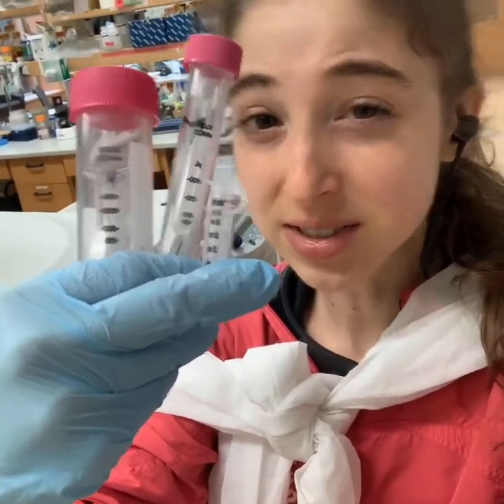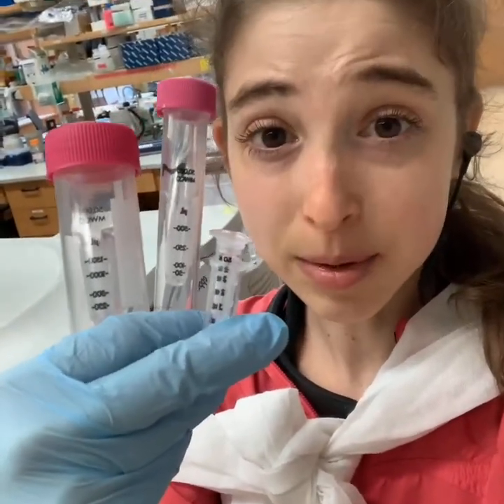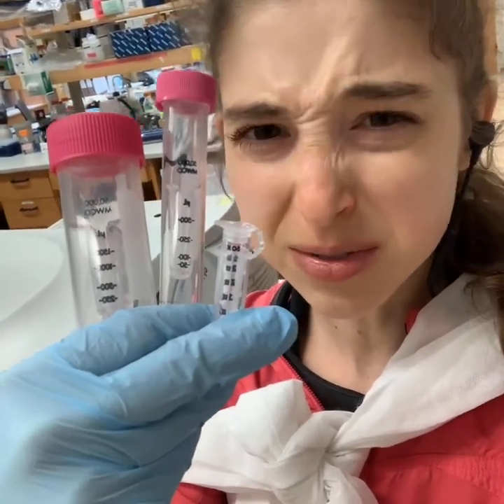I might wear the lab coat cape, but these are some of the real superheroes in the lab. So what are they? They're centrifugal filters.